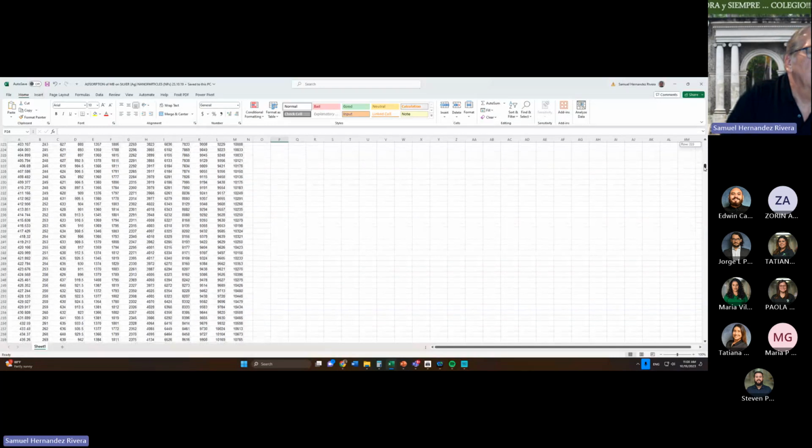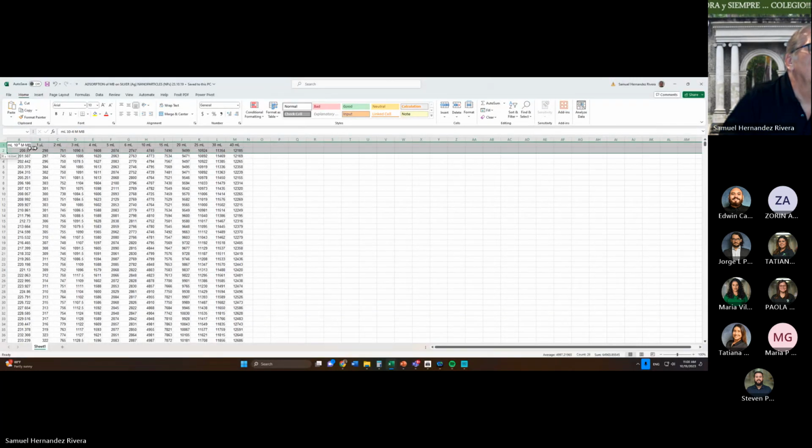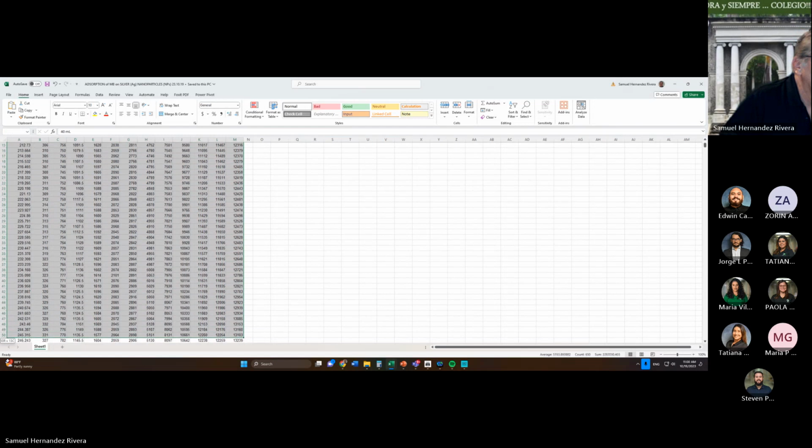So what I'm gonna do is select from 440. Well, first of all, let me represent all the spectra. Lots of data points.